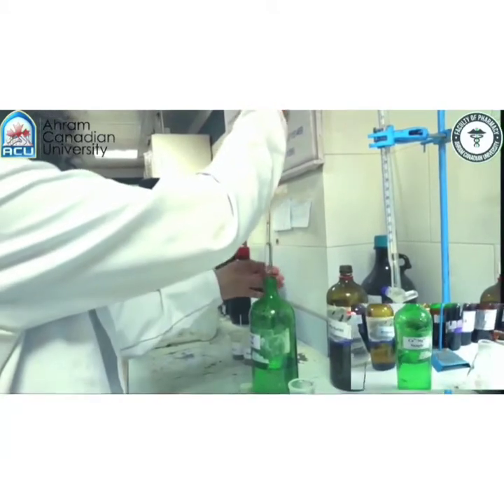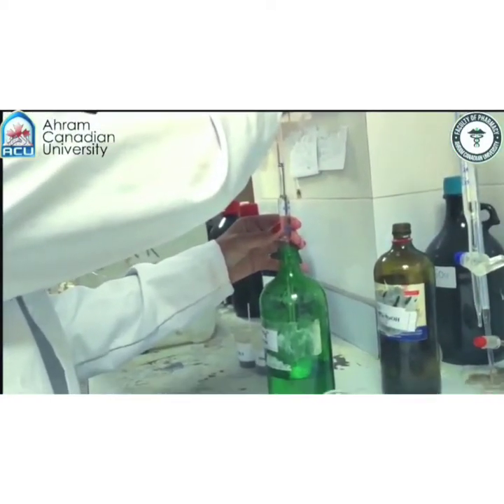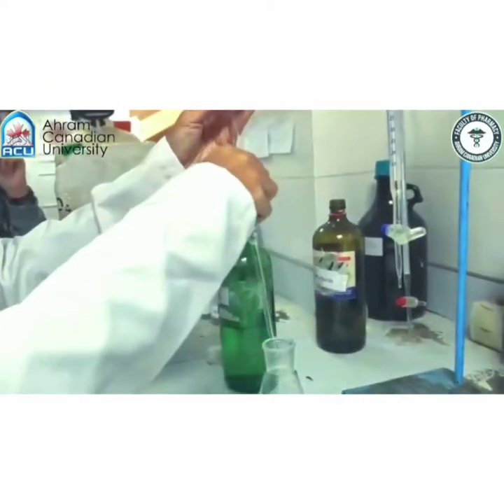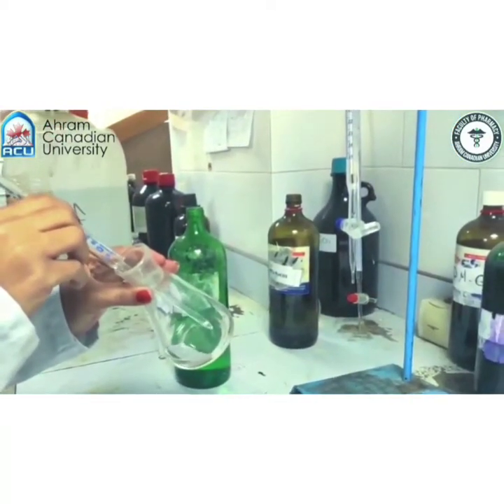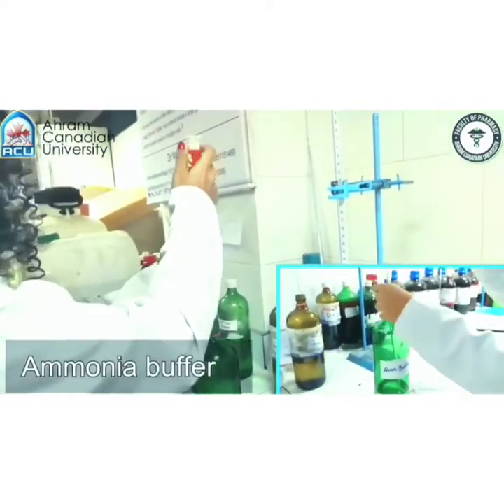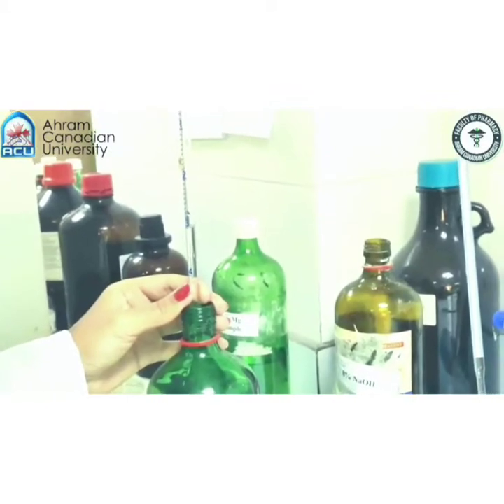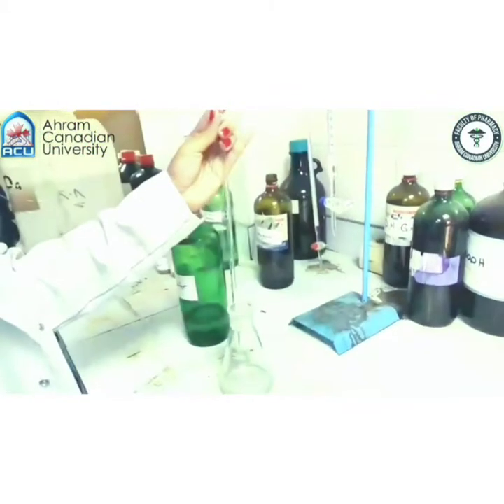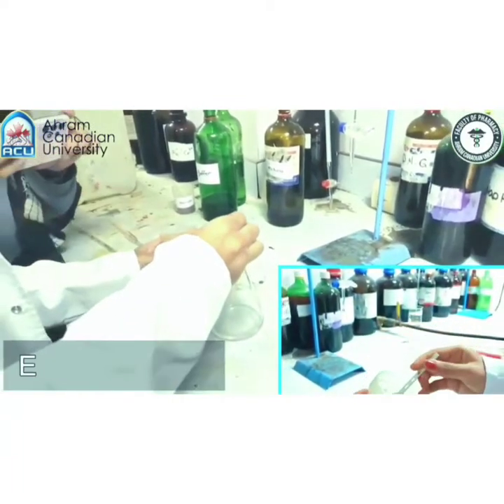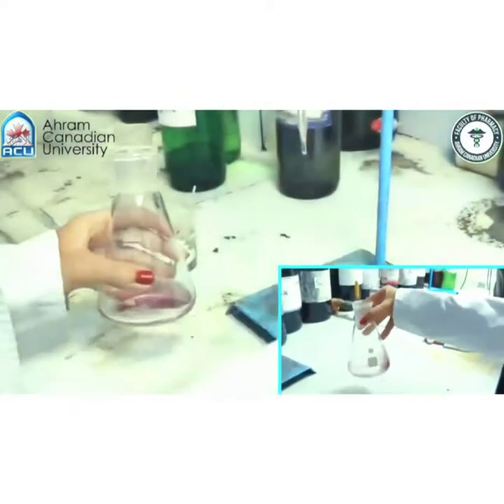Now taking 10 ml of the calcium magnesium mixture sample and putting it into our flask. Now applying 2 ml of ammonia buffer with a graduated pipette and adding it to our flask. Adding a few specks of EBT, which is our indicator, and it should give us a wine red color before titration.